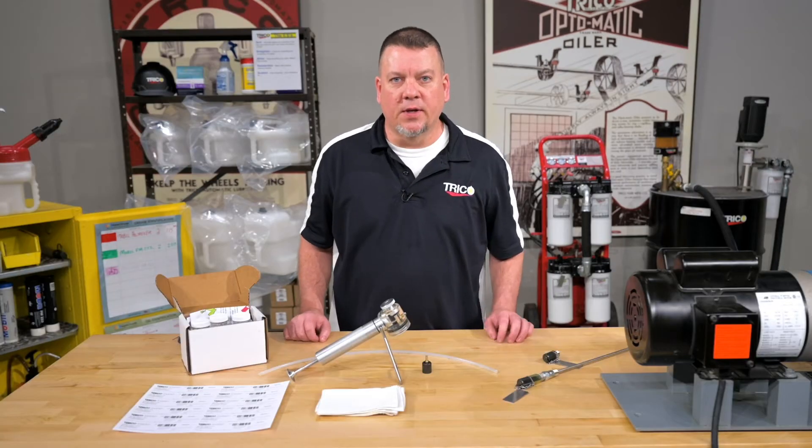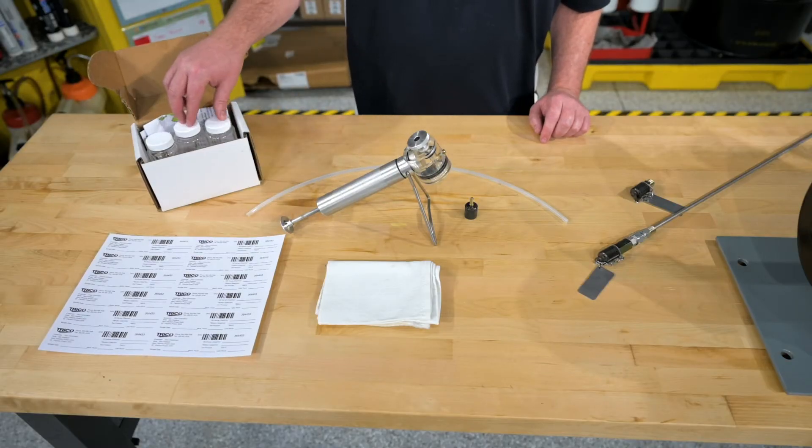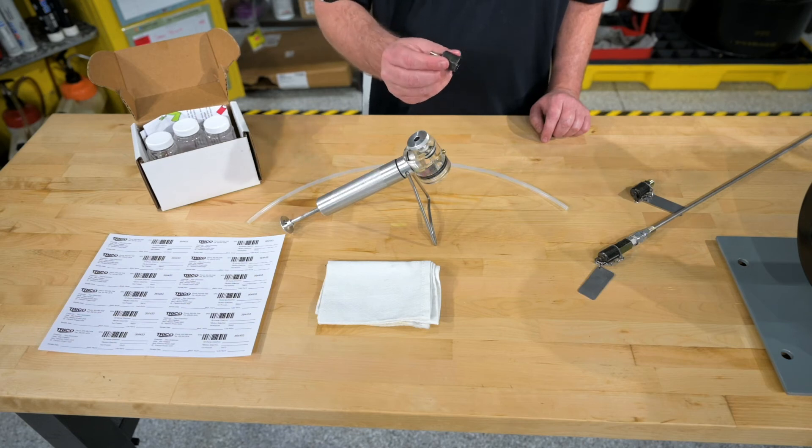Let's take a look at the things we'll need to take a proper oil sample. We have our sample bottle labels, our sample bottles, a lint-free cloth, a vacuum pump, the disposable tubing, and our sample port adapter.